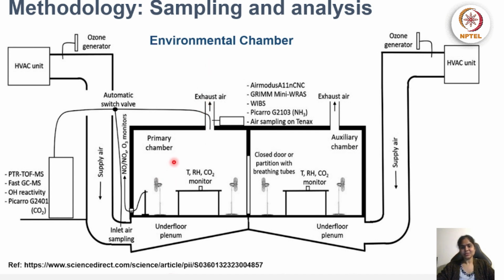Since our interest is a normal indoor environment, we put 4 people inside. So here people are the only sources. Compared to a cattle field or any other hospital environment, houses have very limited sources when only humans are there. So we considered this as a low biomass environment. There were 4 people inside, and we put 2 fans so the air is uniformly mixed, and the composition all over the place will be similar. The temperature and relative humidity were monitored throughout the experiment, and we were also measuring the CO2.